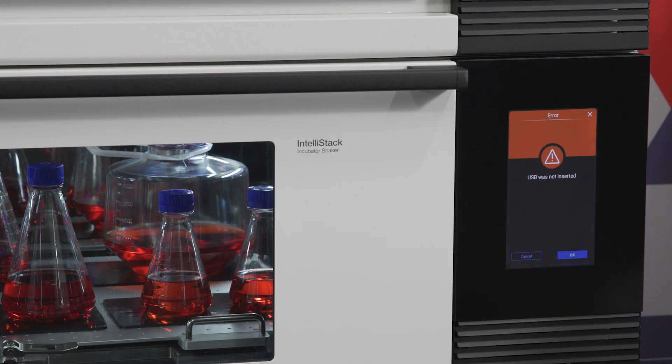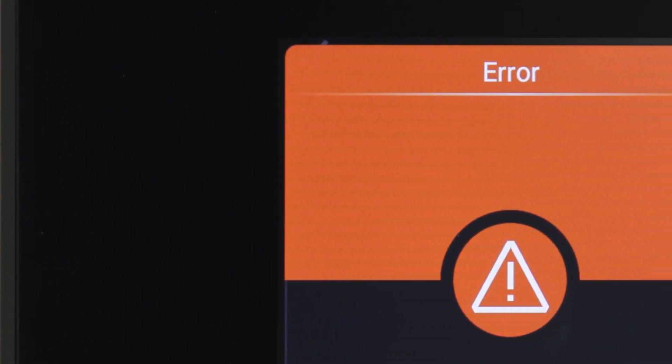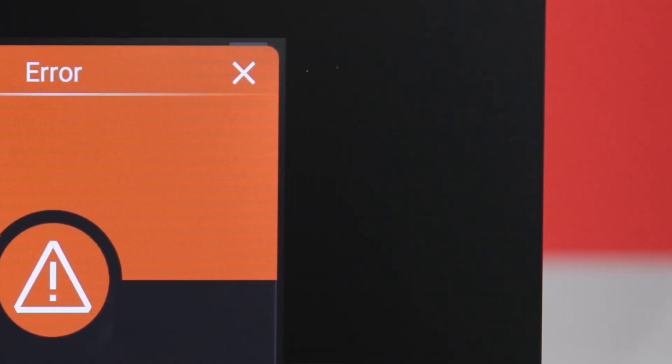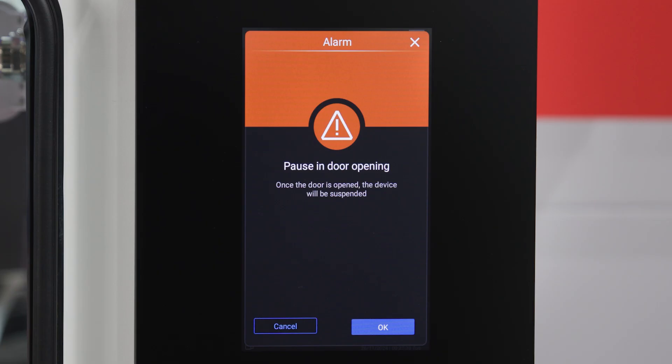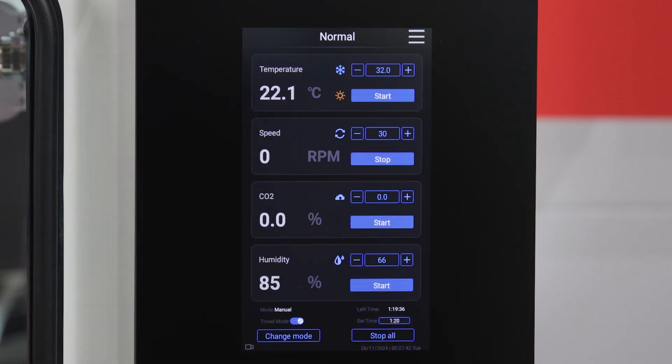If an alarm event occurs, a pop-up display provides you with details about the event and requires you to acknowledge it. A banner will remain across the top of the main interface, and a red or orange outline around the alarming parameter will display until the issue is resolved.